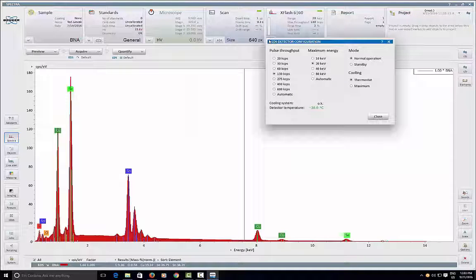This controls our spectrometer configuration. So what throughput mode we want to work with. We used to call this shaping time in the past. Also, what resolution we were going to work with. In this system, we'll collect a 4,000 channel spectrum at all times. That divided into the energy range gives you your eV per channel. So you can have 2.5, 5, 10, or 20 eV per channel.